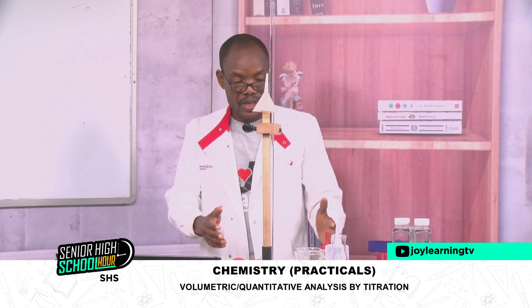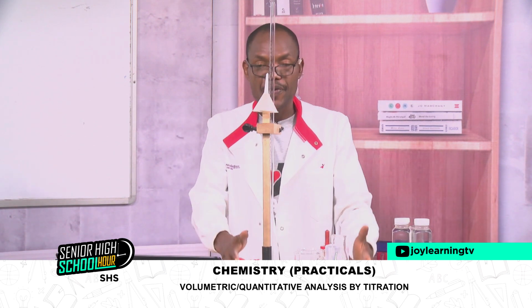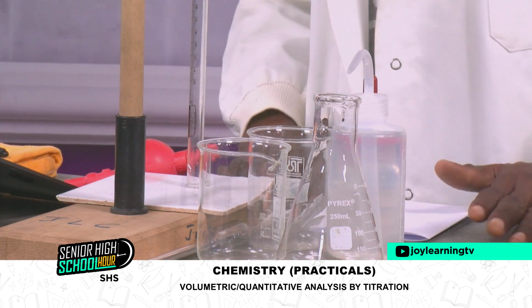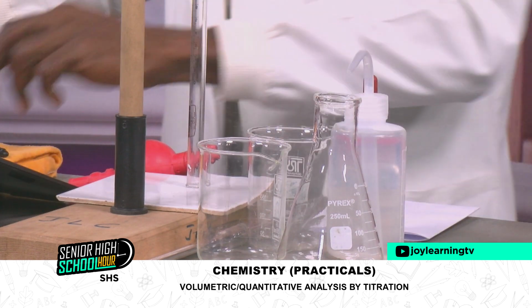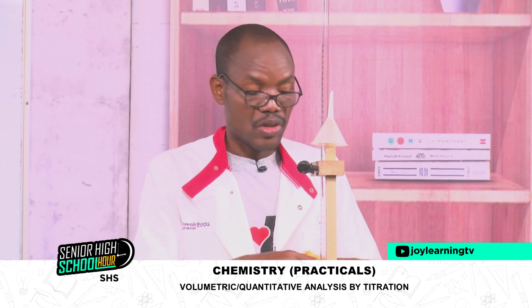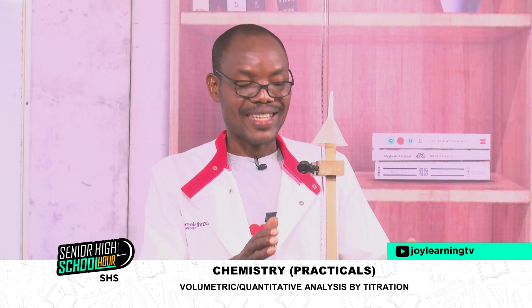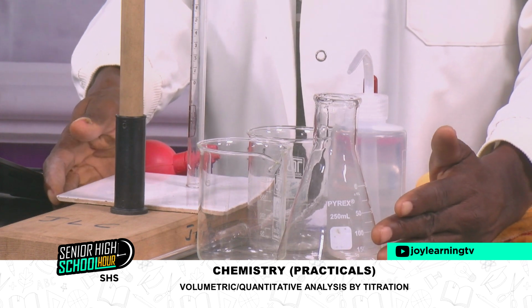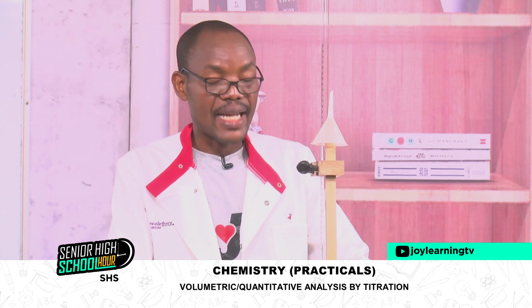So that anytime I walk into the lab, I have it like this. At the end of work, please return everything together like this. If you have any solution spill or water spill, please keep your work area clean and dry. So you will want to have a napkin or a rag or a tissue to make sure that your work area is dry and clean. This is how you assemble. Don't go and scatter everything. No, unacceptable.